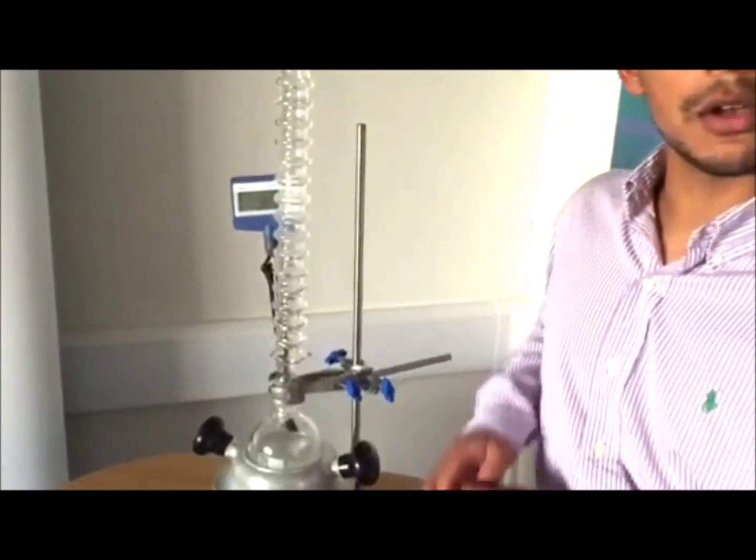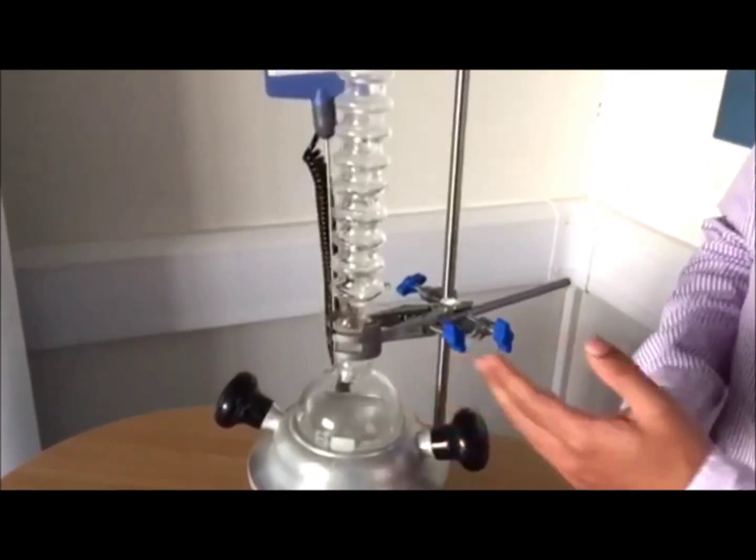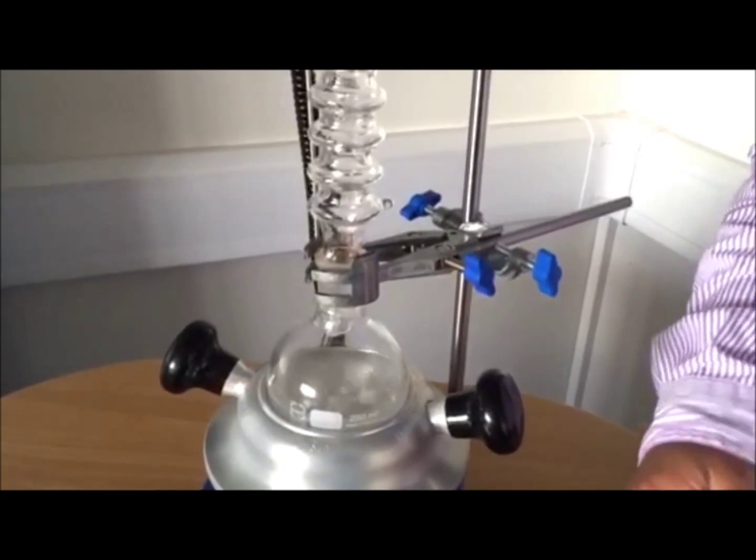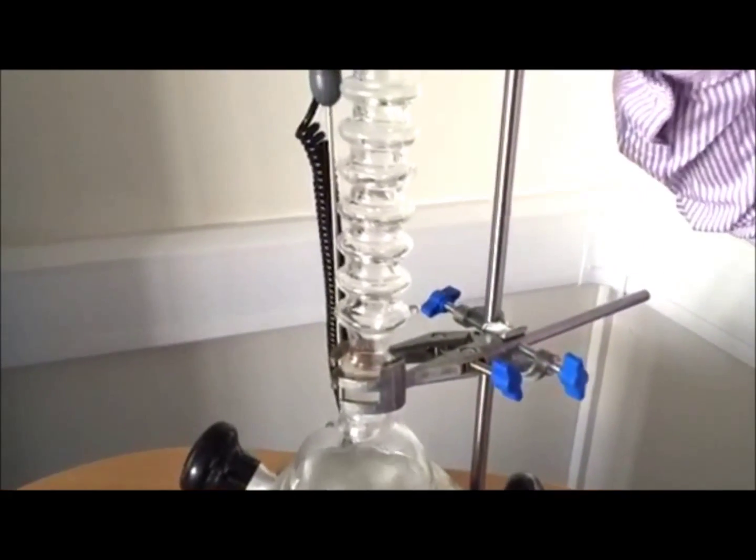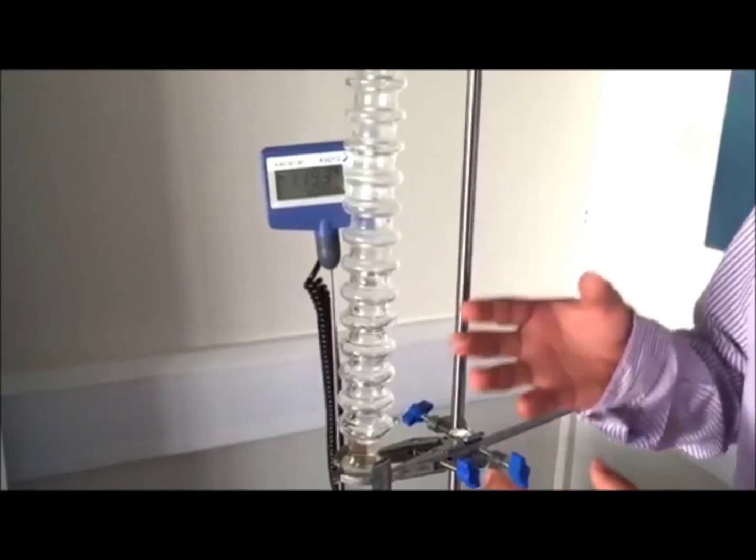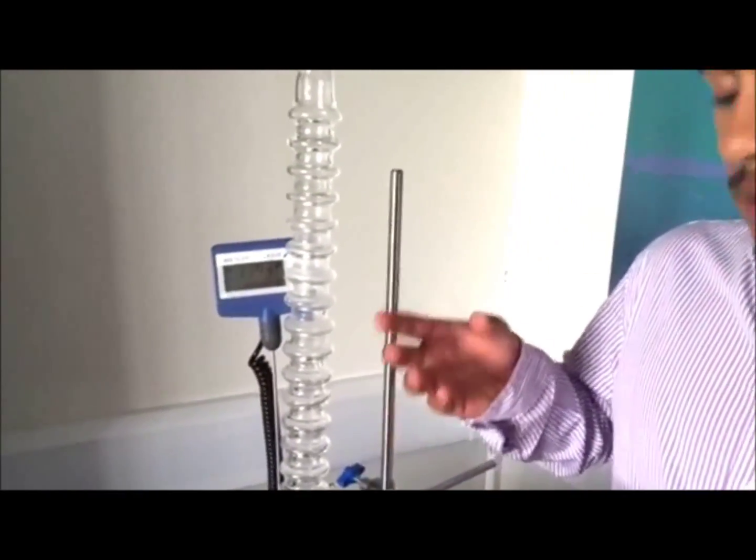Here we've got a 350mm long column and we've got water vigorously refluxing here. As you can see, we're getting almost 100% efficient condensing due to the unique design of our condenser.